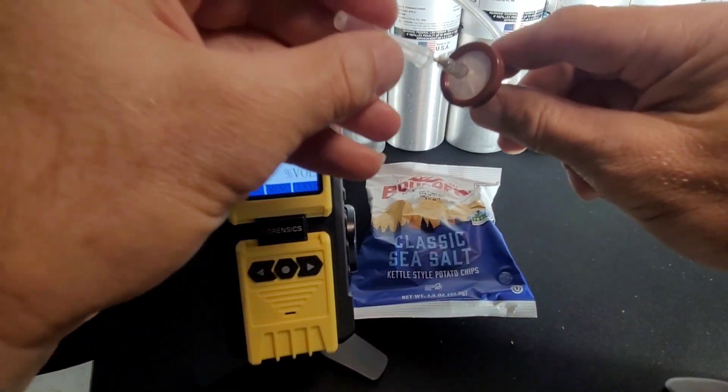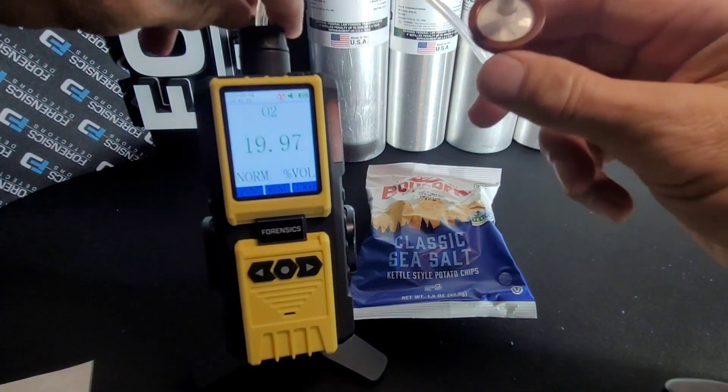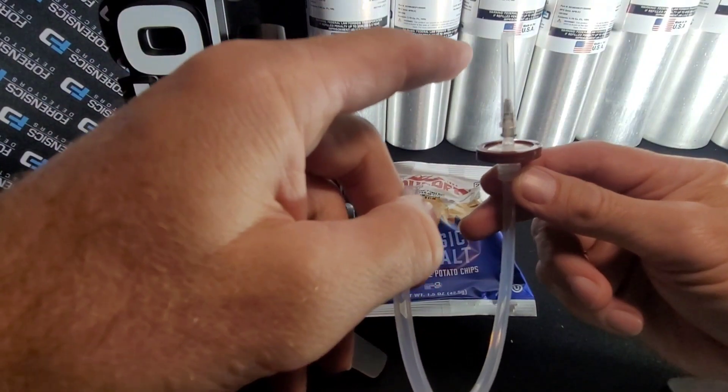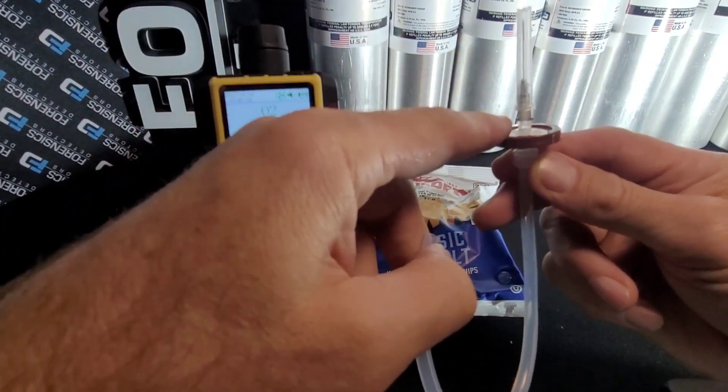Once you're done with your measurement, just go ahead and pop the cap on the needle. If you want, you can take off the tubing. Make sure you have unblocked needles and a good filter.